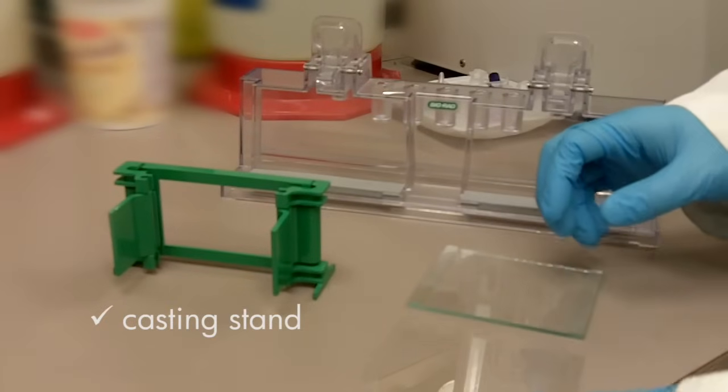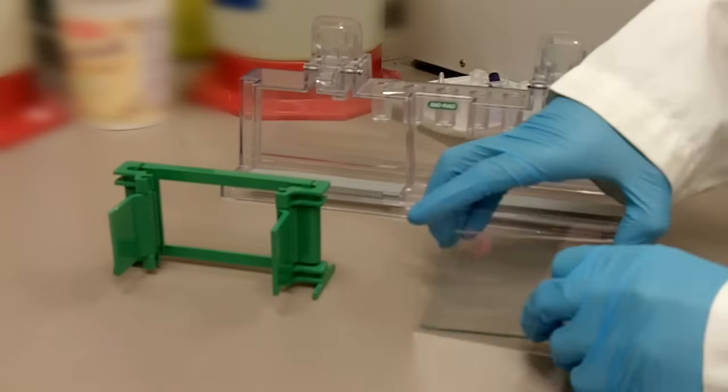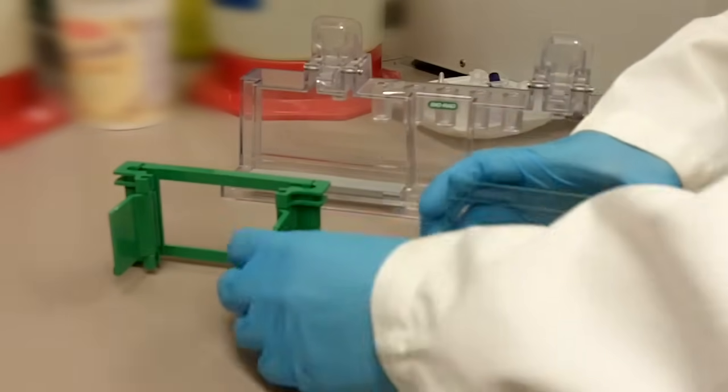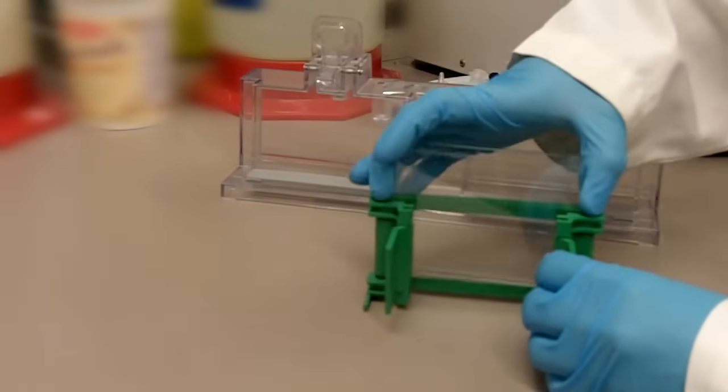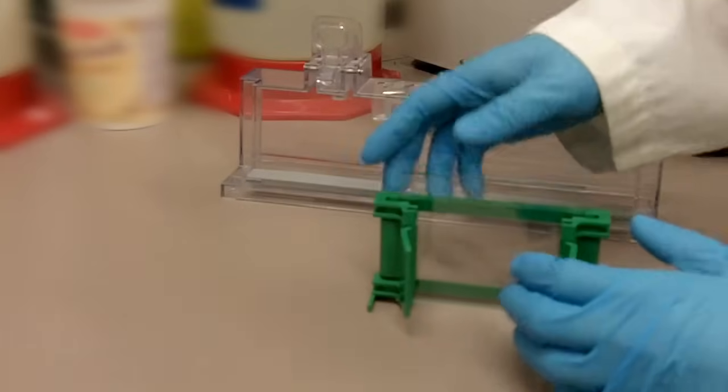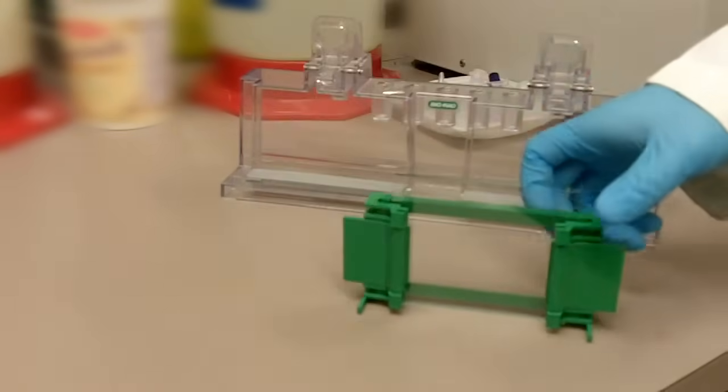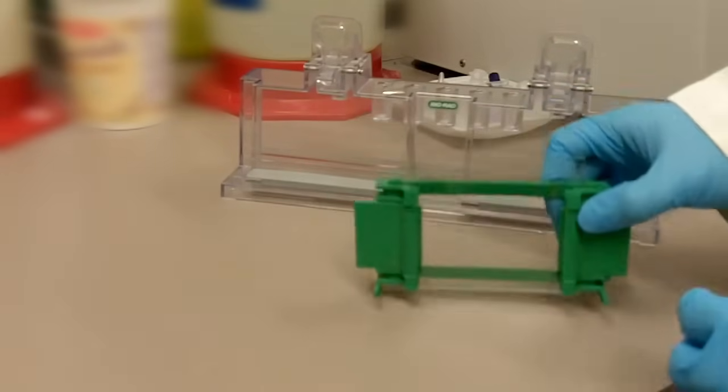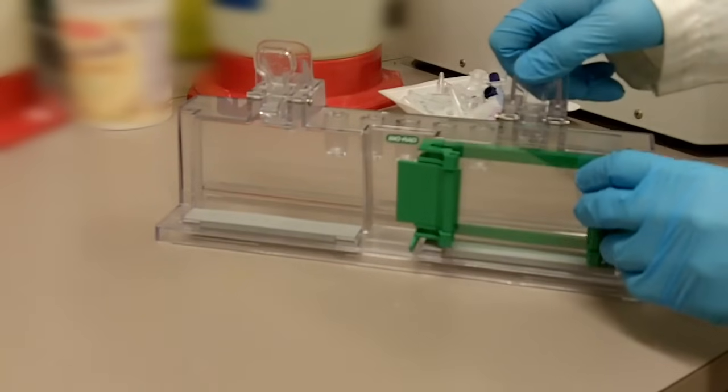What you do here right now is you want to place the short plate in front of the tall plate like that, and then put it into the casting frame. After you put it in the casting frame, you secure it by clamping it and then you want to check that the bottom is flat. When everything is done, then you can put it on the casting stand.